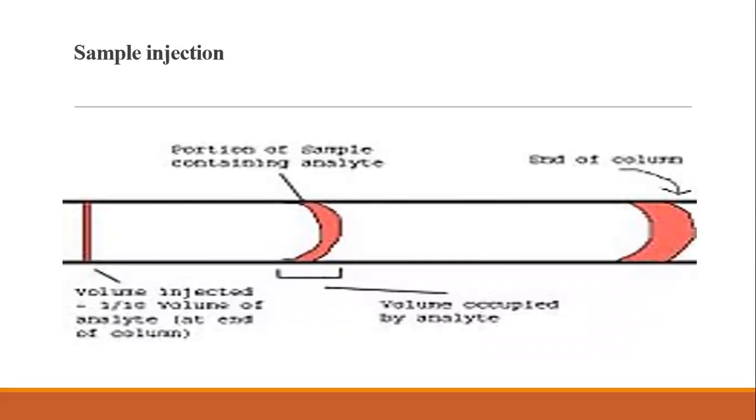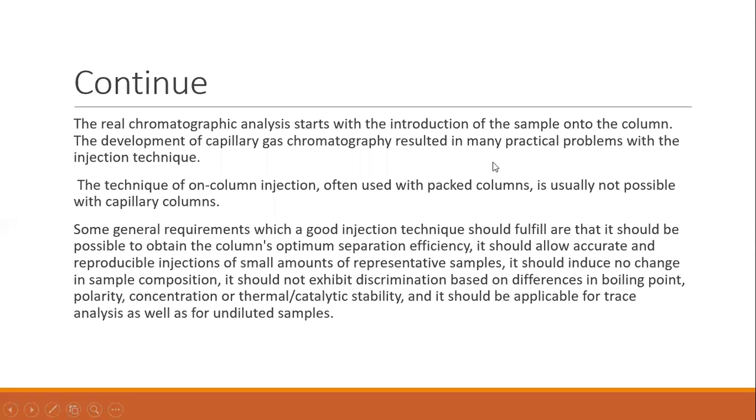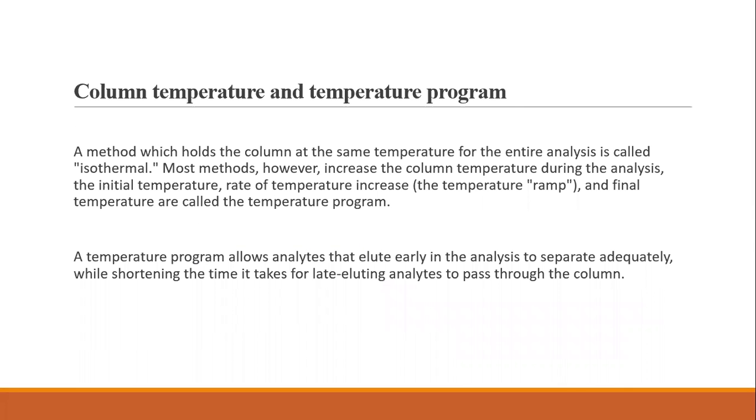This is a diagram of sample injection, which is like maybe a capillary through which the process takes place. Next one is column temperature and temperature program.